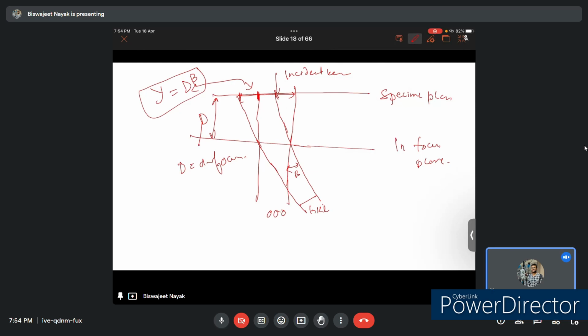So another question can be asked: if the SAD aperture is placed at the first image plane, how can it affect the diffraction spot which is formed above it? So the relation between the SAD pattern and images can be seen through multiple dark field images.